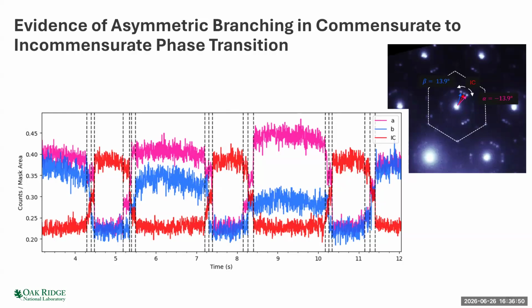There are several interesting things, one of which is that I was heating or cooling continuously on a ramp, yet the actual phase changes are very sharp, and different phases perhaps are changing at different temperatures. There's also a difference in the amount of each phase that's generated. So it's a fairly reversible process, but not exactly. Sometimes these things are coming back to different phases.